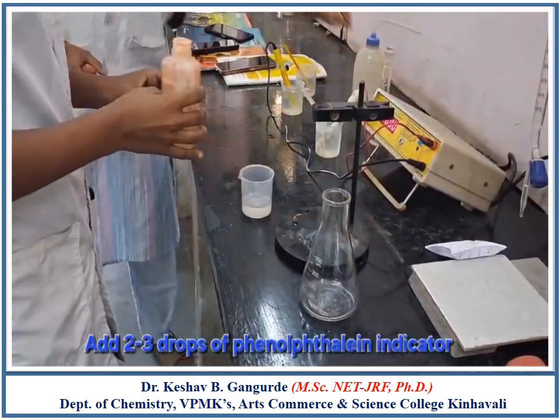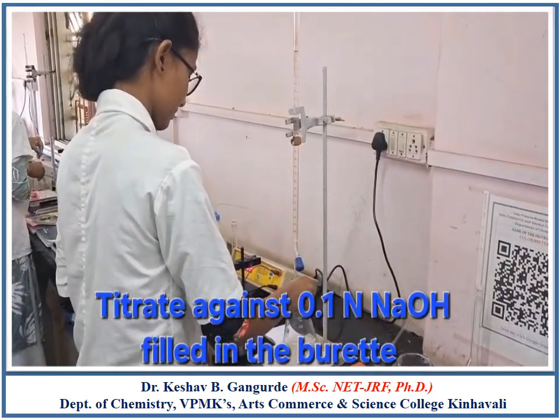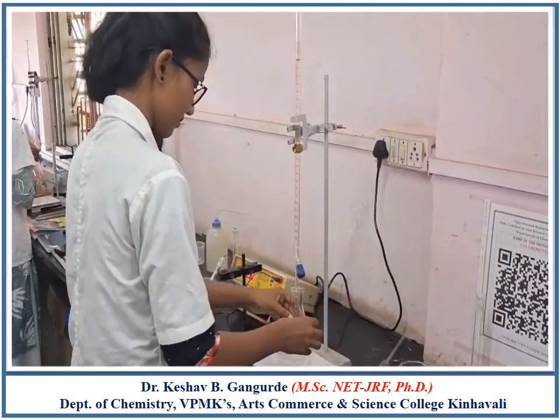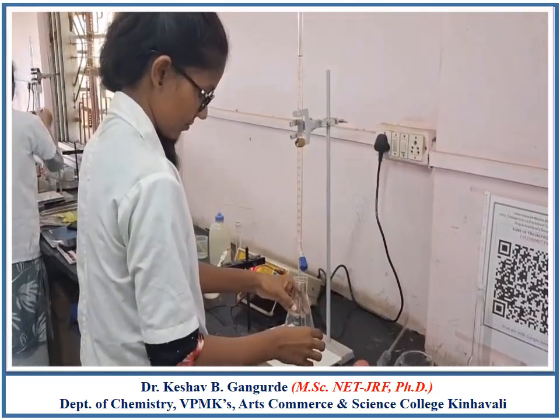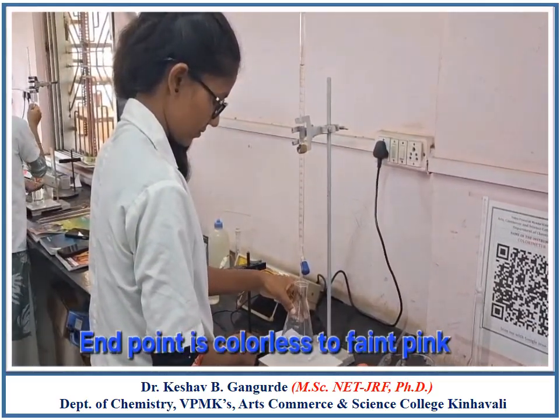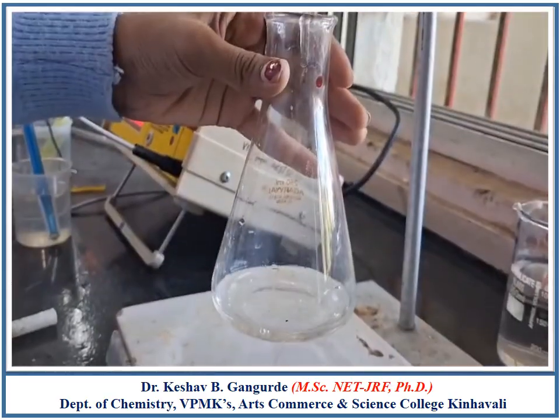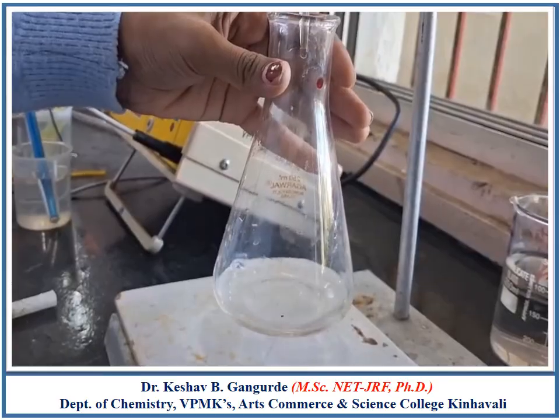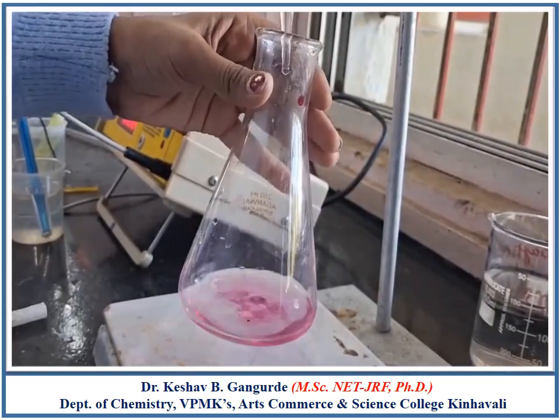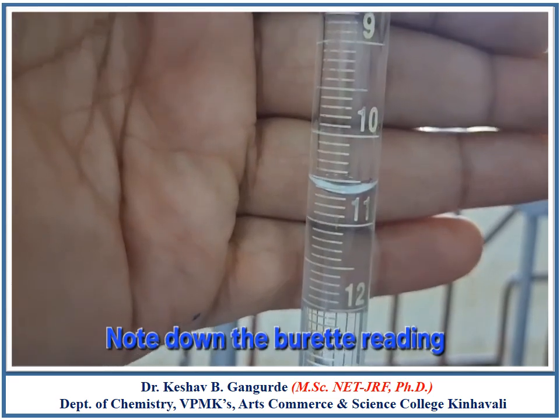Add 2 to 3 drops of phenolphthalein indicator and titrate it against the burette solution, that is 0.1 normal NaOH solution, till the end point, colorless to permanent pink. Burette reading is 10.7 cm cube.